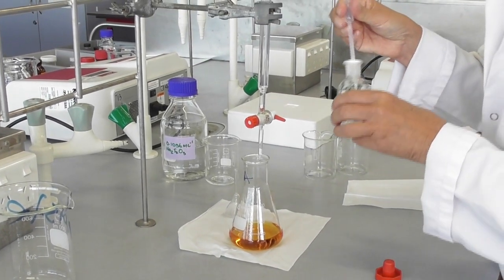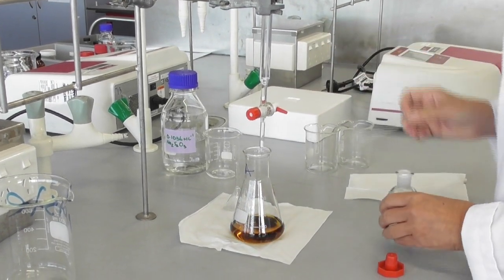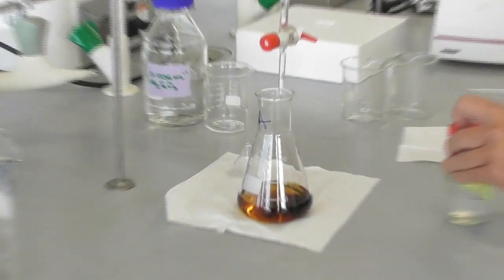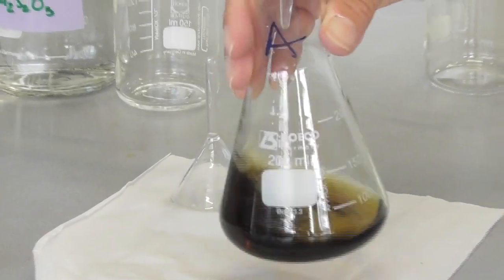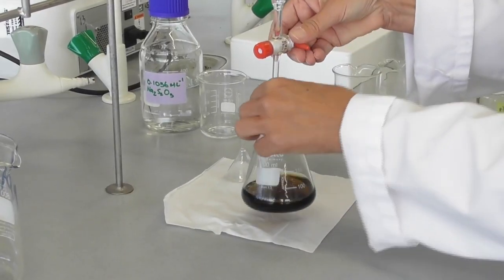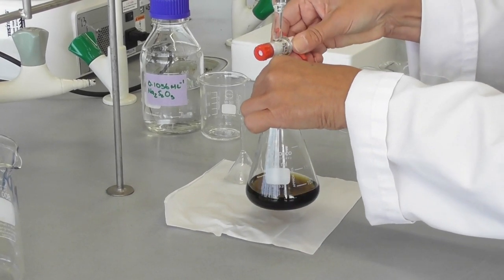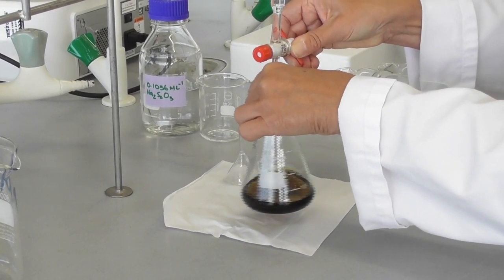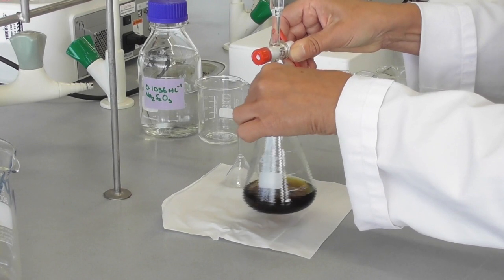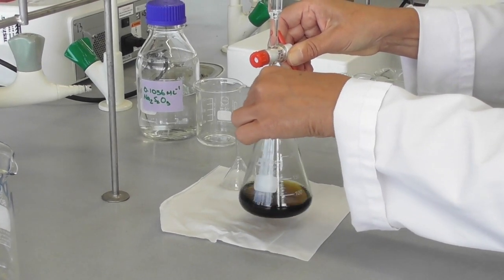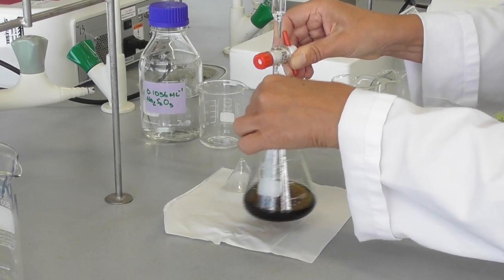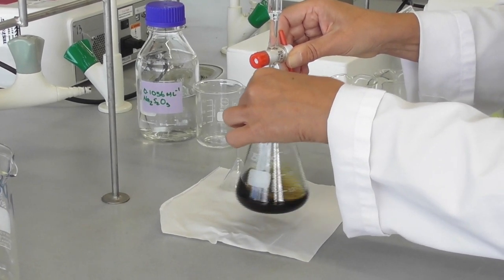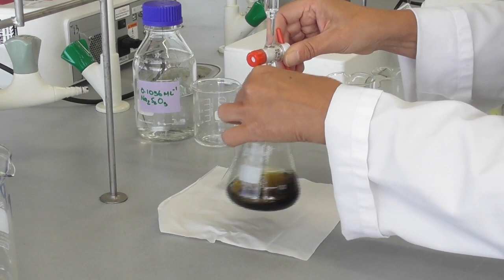I add about one milliliter of starch solution which turns the mixture quite dark, and as I'm nearing the end point I add the thiosulfate solution very slowly at this point, ideally drop by drop, while still constantly swirling.